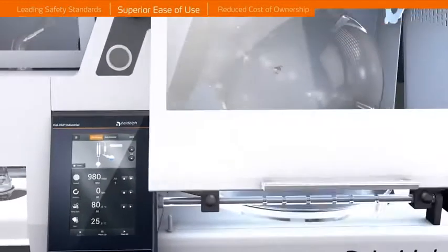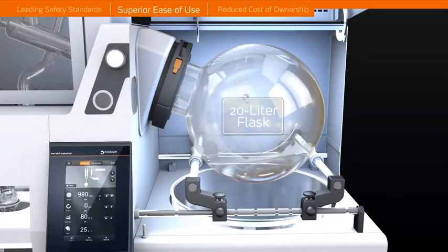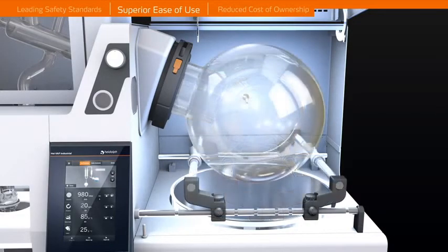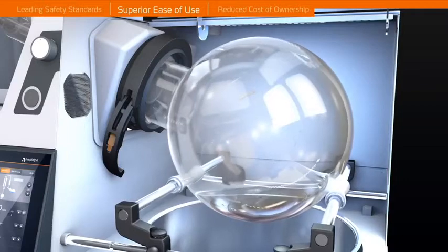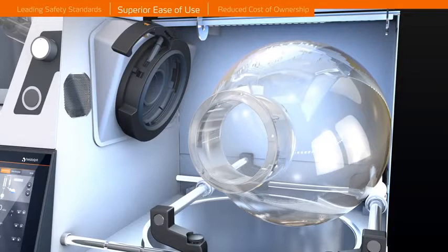Superior Ease of Use. All HiVap Industrial models are equipped with a newly developed intuitive and safe flask removal system. Integrated markings and indentions allow for easy adjusting of handles specific to which flask size you are working with. The Easy Lock System ensures your evaporating flask is in proper position and locked.